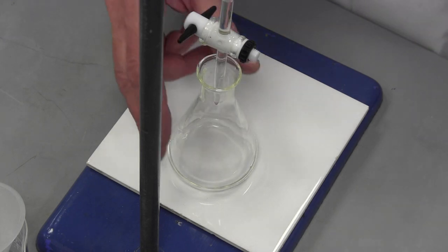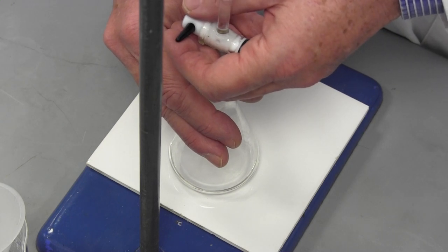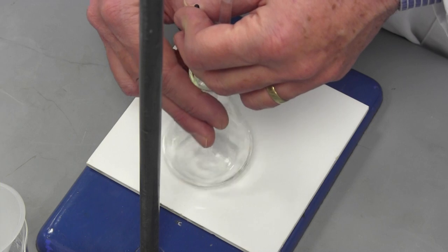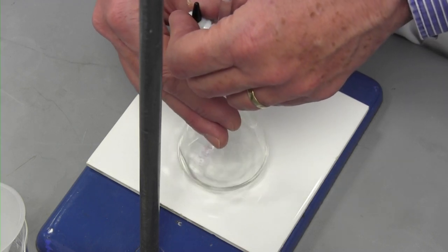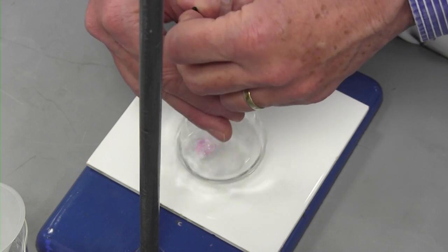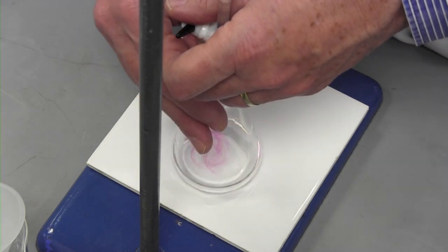Now we can perform the titration. The conical flask is placed under the tip of the burette using the stronger hand. I'm very right-handed, so I'll hold and swirl the flask in my right hand. My left hand is used to support and operate the tap. It is important to watch what is happening in the solution, not the level of the solution in the burette. As the base runs into the flask, it is neutralised by the acid and hence less acid remains. At this point we can see no change in the solution because the indicator is in an acidic solution. After a while, as the base runs into the solution, a patch of pink forms in the middle. This is because in that part of the solution the base has destroyed all of the acid. However, as the flask is swirled, acid is brought in from the edges of the flask and the indicator changes back again.